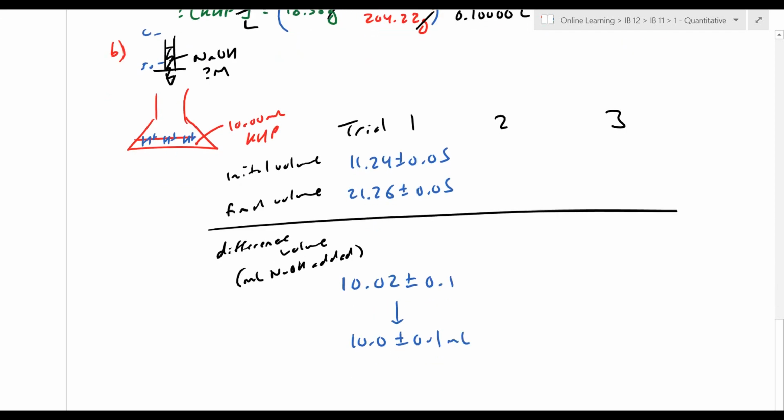When I did that first just approximate trial, I had overshot this one. This one here had become overly pink. So it's totally okay for you to drop this. That just gave me a ballpark. 10 is too much. Then what you saw is when I did test 2 and test 3, I did somewhere close to 10. I did maybe 8 mils safely. And then as I got close to this 10 mark, I started dropping them in smaller increments. Maybe not 1 mil increments, maybe half a mil increment, or maybe 0.1 mil increment.